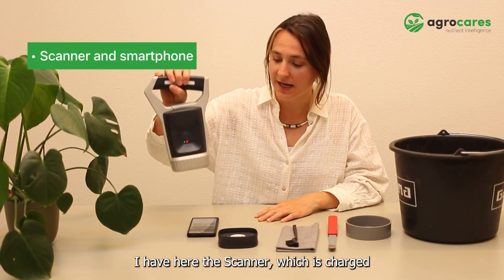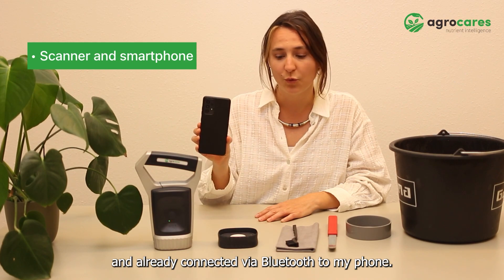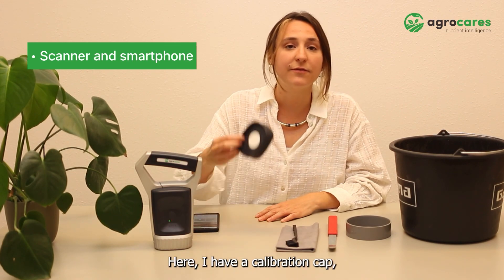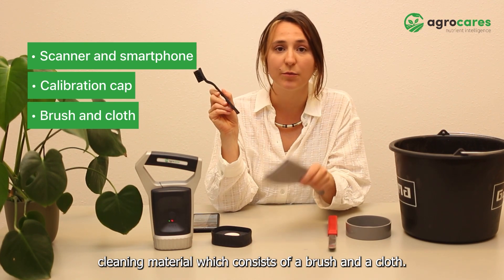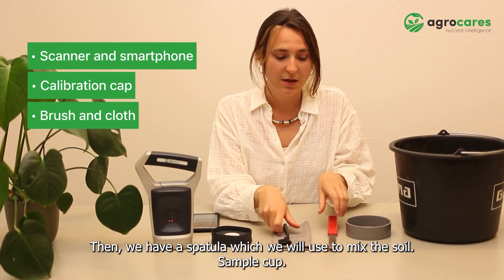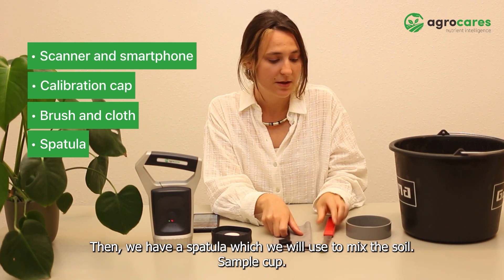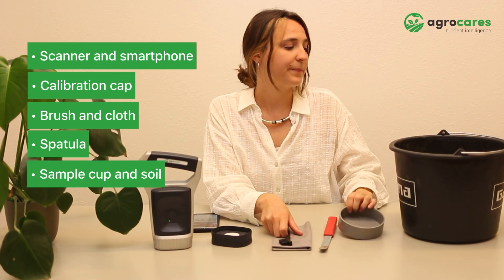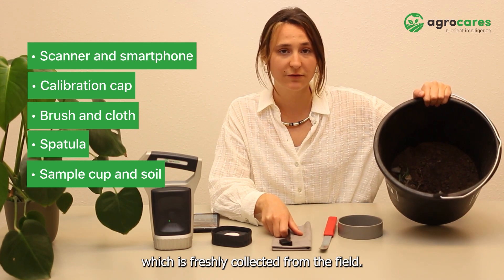I have here the scanner which is charged and already connected via Bluetooth to my phone. Here I have a calibration cup, cleaning material which consists of a brush and a cloth. Then we have a spatula which we will use to mix the soil, a sample cup, and in this bucket I have soil which is freshly collected from the field.